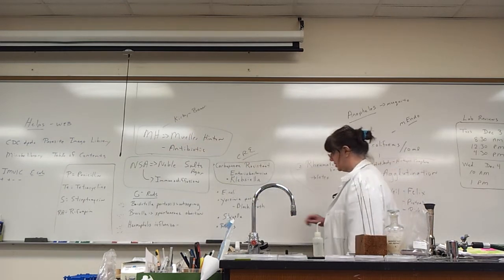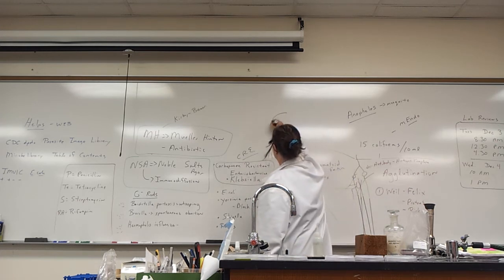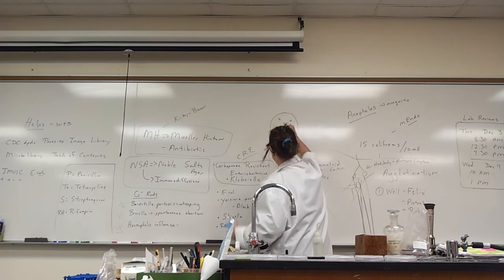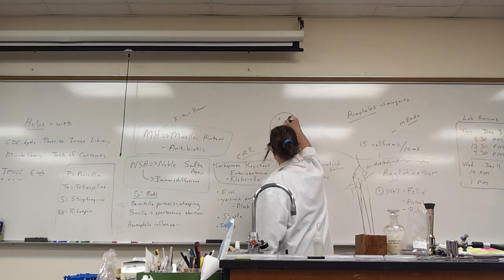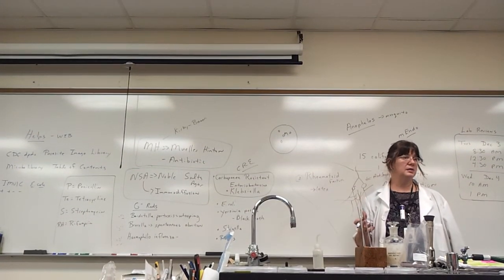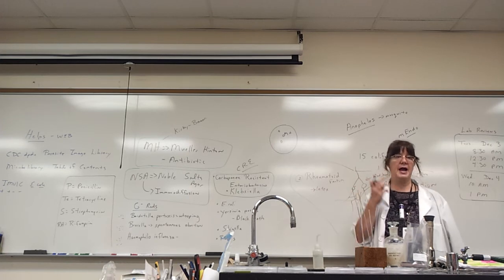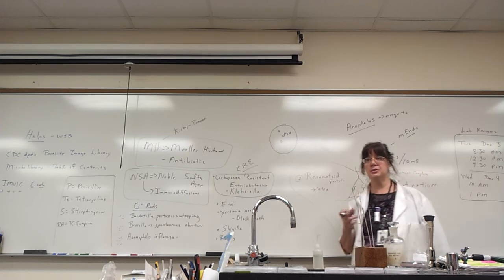I'm going to draw way up here, and several things can happen with that. You'll see this up front. Remember, you made your wells and you loaded them. You did horse, cow, and pig. I'm going to do this three ways: one, like you did in lab, and two, for applications according to real labs.